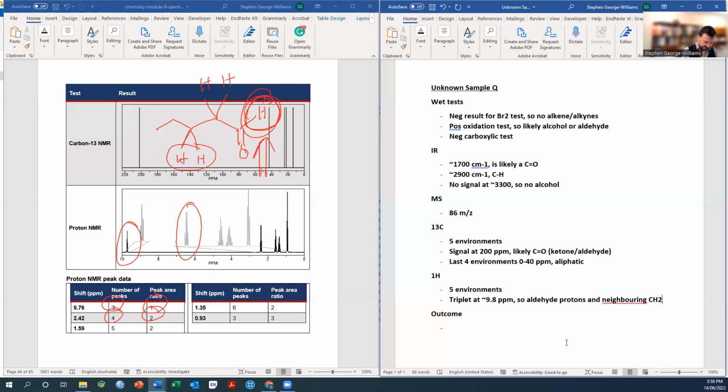Continuing down my chain, as I'm getting further and further away from my aldehyde. So looking from the perspective of these hydrogens, there are 4 adjacent to that. So there are 2 hydrogens here and 2 hydrogens here. So I'd expect a pentet. And again, I'd expect an integration of 2, which is what I'm seeing.